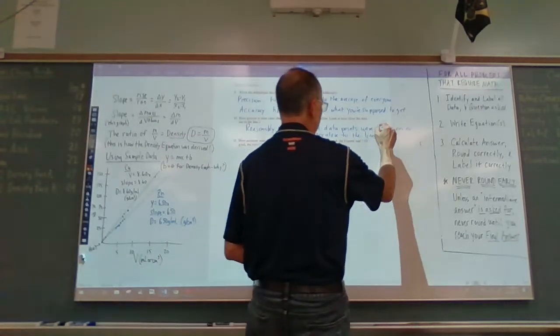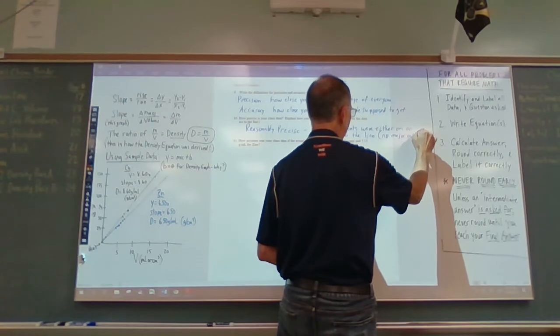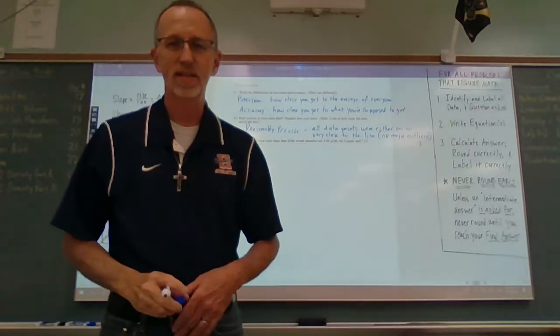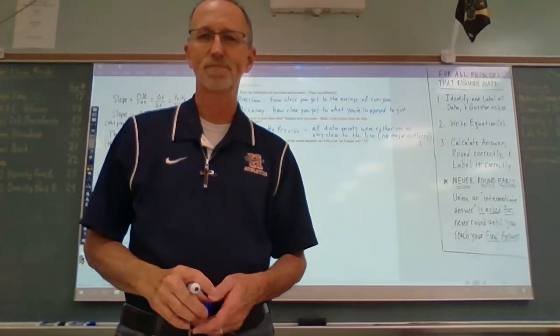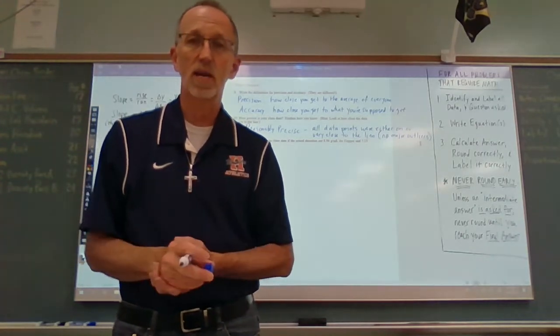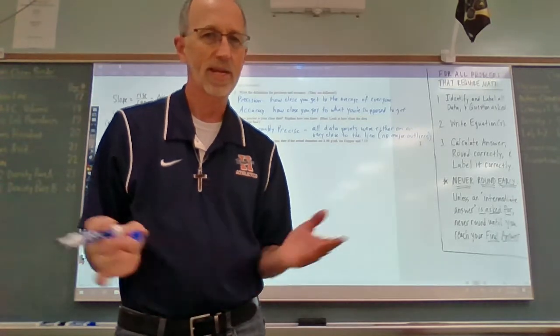So that's good. No major outliers. You will get outliers, but again, you have to take those with a grain of salt. That's why they're called outliers. For whatever reason, measuring was done incorrectly, or the interpretation was incorrect, or whatever. It happens.